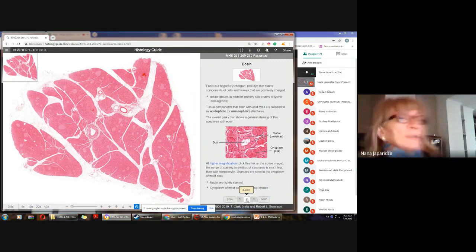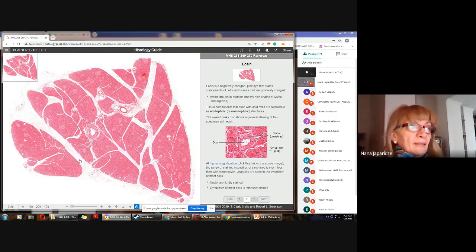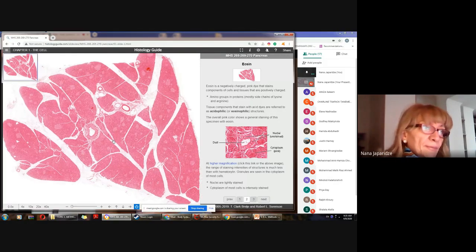This is an acidic dye, and you can see that it is able to stain tissue samples, usually in color from pink to quite dark red. So here is stained everything which contains protein.